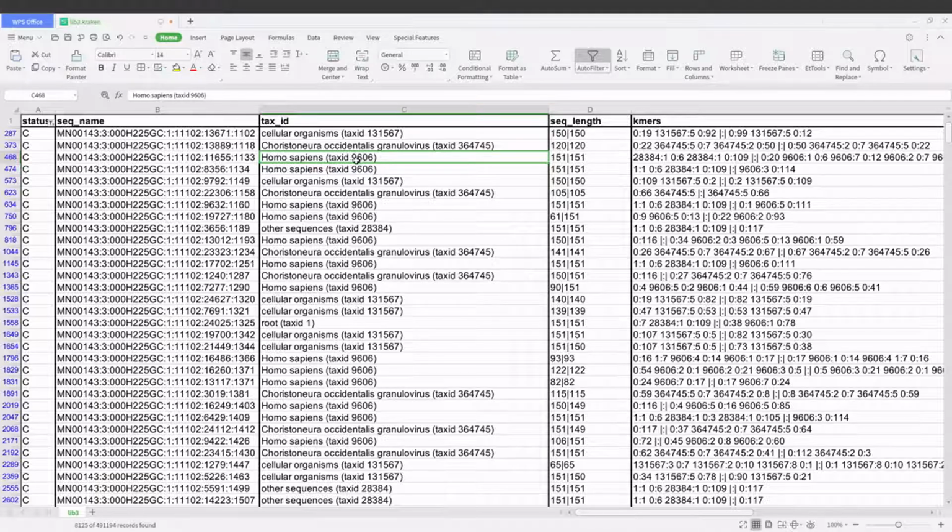We can also use this study to understand, or even identify, the habitats of the mosquitoes. Because some of the organisms may be found predominantly in certain locations or areas. If we see them appearing here, then it means that the mosquitoes probably also have their habitats in those locations or close to those locations. I am only scratching the surface here, so I believe this will help you to also analyze your own data.